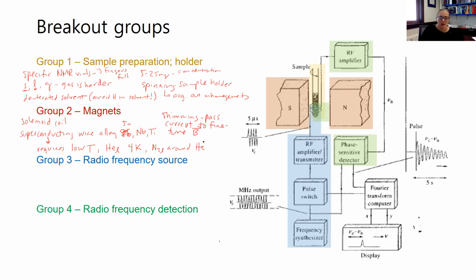And you'll see with liquid helium, I know someone who runs an NMR core, and they're always like, I don't know if you guys have heard about how there's helium shortages and we have to mine helium, and it's a limited resource. So when you're using those helium balloons, you're taking away helium for our NMR measurements. I've heard people say that for cooling those down. Cool. Any other comments about magnets or questions?